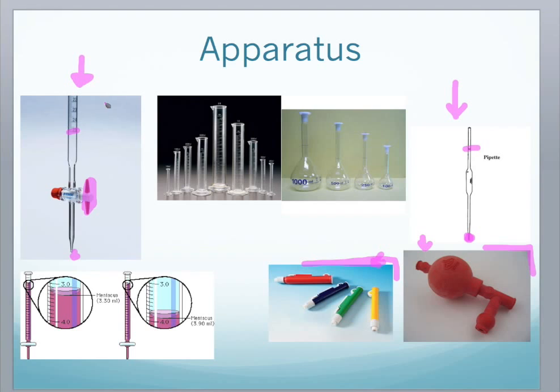Remember, once you've finished filling it, always remove the funnel. Then you let the liquid run out until there is no air in the stem. Again, in the stem here, there might be some air, so make sure you let the air come out before you start the titration. If you fill it up to 0, that will be your initial level, so it'll be 0.00.